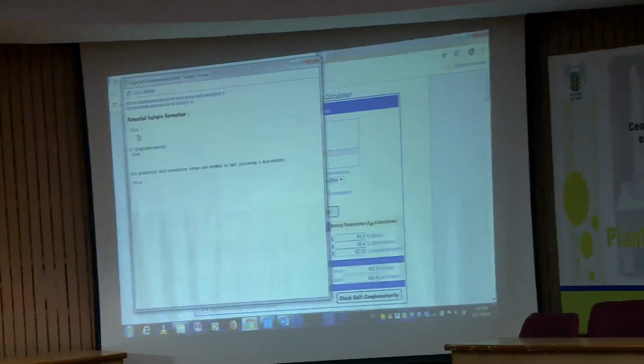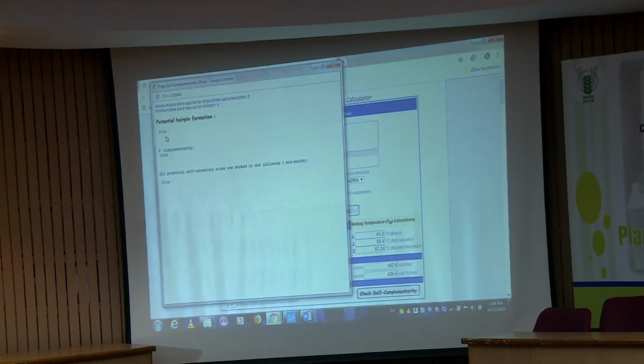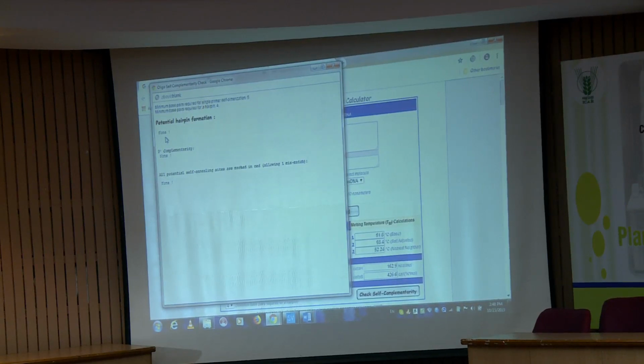They will give you the primer in a particular concentration, some nanomolar concentration. Generally they provide the lyophilized form of your oligonucleotides. They will deliver it to you, then you resuspend according to the concentration which the company provides. The stock solution, always make it 100 picomole per microliter. Then whenever required, you dilute that primer to the required dilution, maybe 10 picomole or 5 picomole. You do the dilution as and when you want.